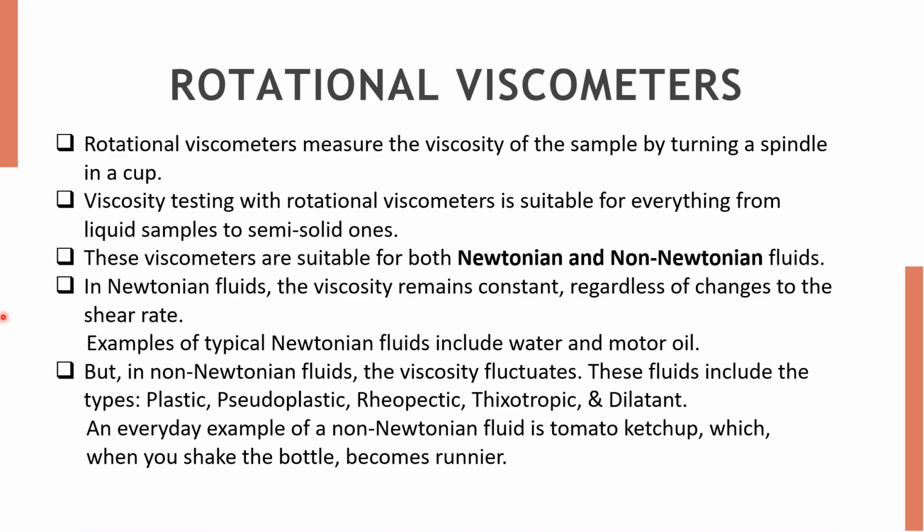So, for Newtonian fluids, the viscosity remains constant regardless of change to the shear rate. Examples of typical Newtonian fluids include water and motor oil. But in non-Newtonian fluids, the viscosity fluctuates. These fluids include the types like plastic, pseudoplastic, rheopectic, thixotropic, and dilatant. An everyday example of a non-Newtonian fluid is tomato ketchup, which when you shake the bottle, becomes runny. Generally, most viscometers only measure fluids which are Newtonian. But rotational viscometers can measure both Newtonian and non-Newtonian fluids.